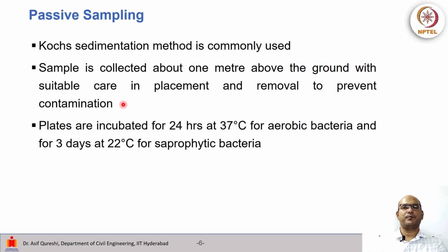So we will keep it in a relevant place in the indoor environment, but not in a place where a person will manually put something, or it gets disturbed by people moving around and throwing things, and those extra things go in the plate and skew the results. So suitable care has to be taken in the placement and the removal so that contamination can be prevented.